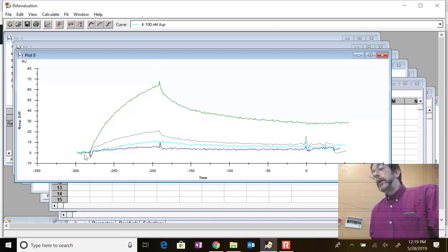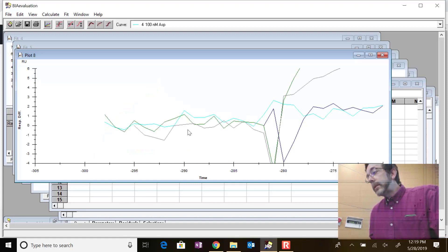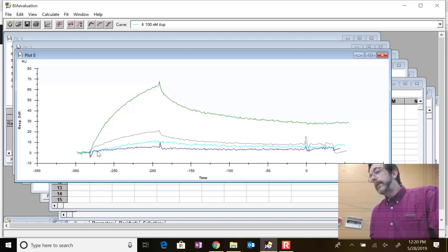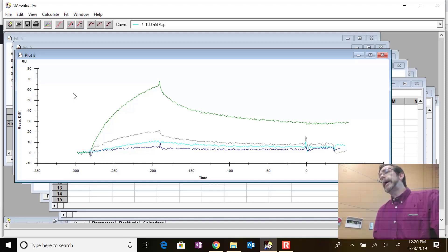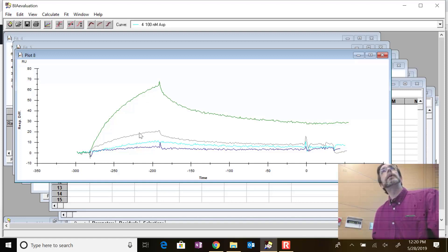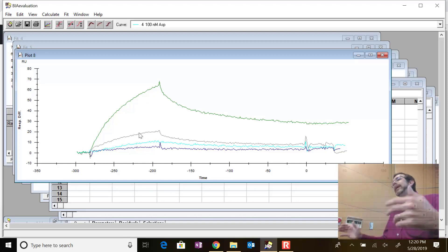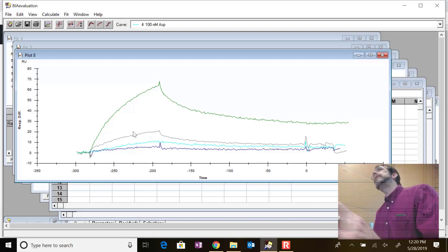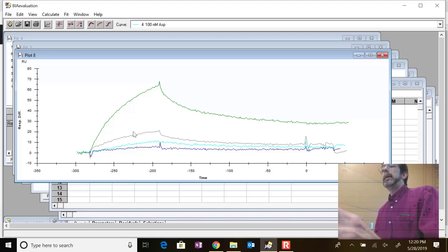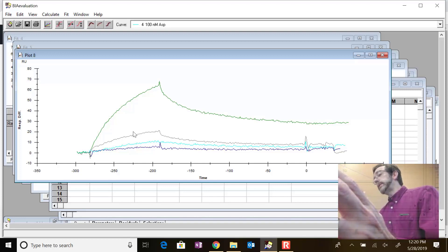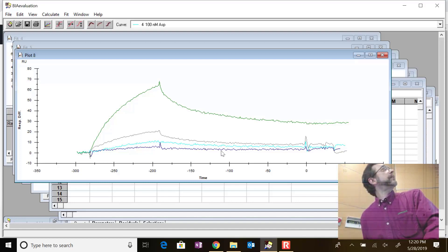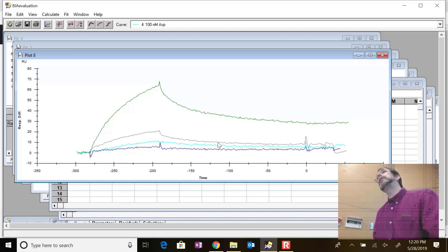Double-check that you're still zeroed over here - it looks like we are, and everything looks good. You can always go back and forth and edit individual curves. Just remember: if you're editing one of these curves individually, it's going to affect all of the plots built from that curve. That's usually what you want. If you have curves disagreeing - especially if you look at the slopes - and you have the low concentrations sometimes going up when they should be going down, that won't fit kinetically.